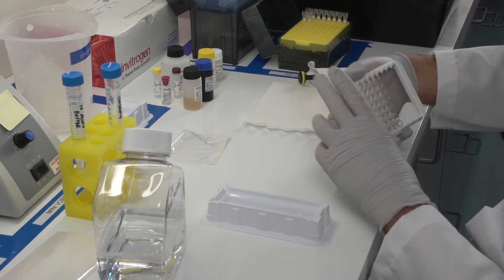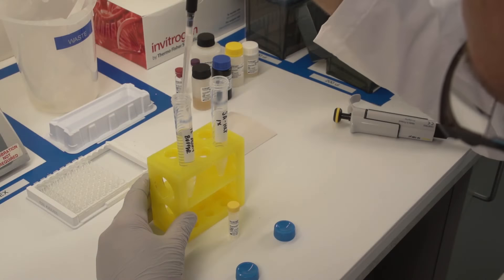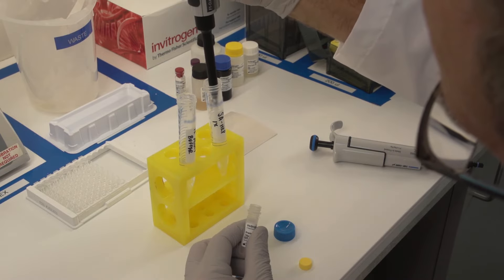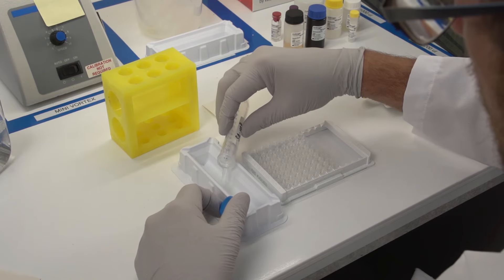Do not allow the wells to dry. This washing step will be repeated throughout the protocol. After washing away unbound detection antibody, prepare streptavidin HRP by diluting the concentrate in assay buffer.